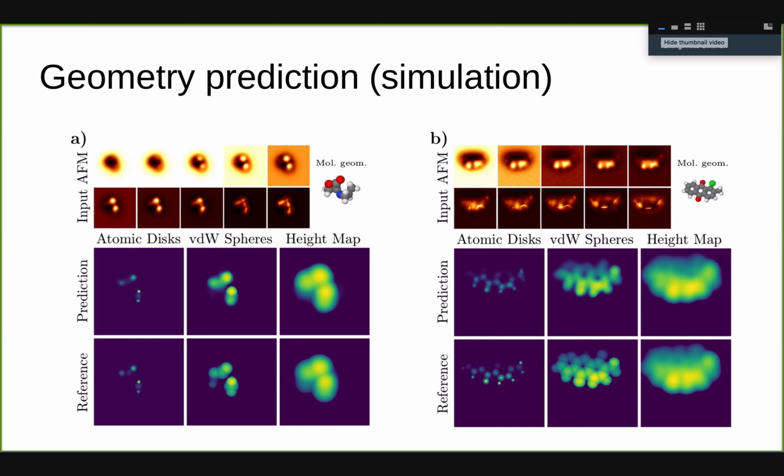Of course, the simulations are not what we're aiming at. We would like to also test this on experiments. For experiments, we of course then have the difficulty that we don't have this kind of reference solution, especially in these more 3D cases where it's difficult to know what you're even looking at.